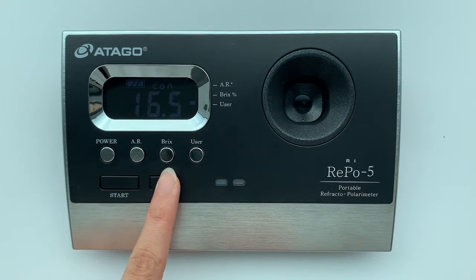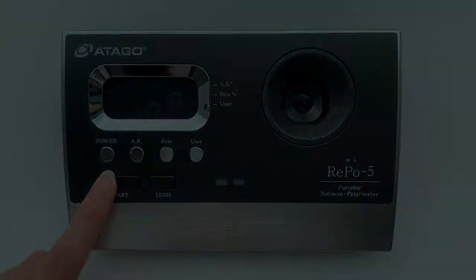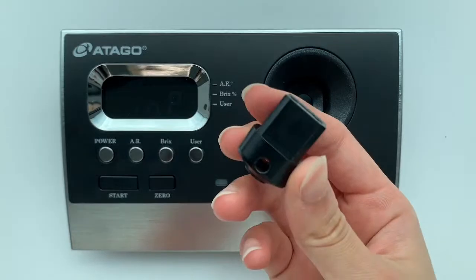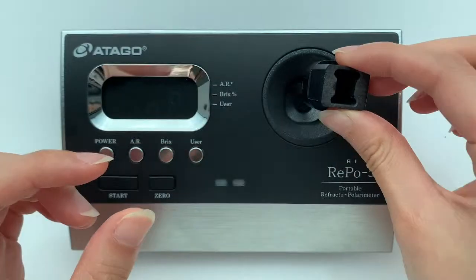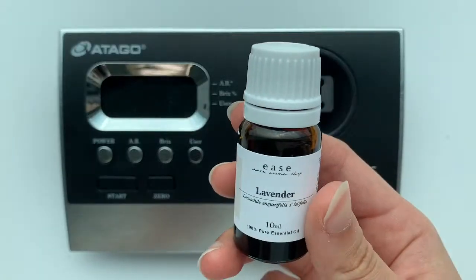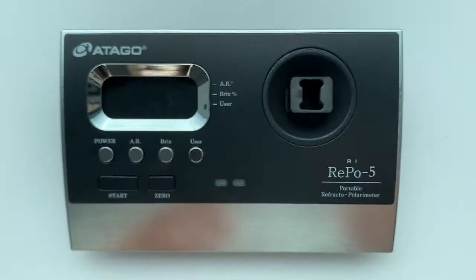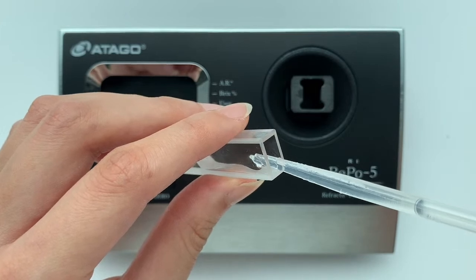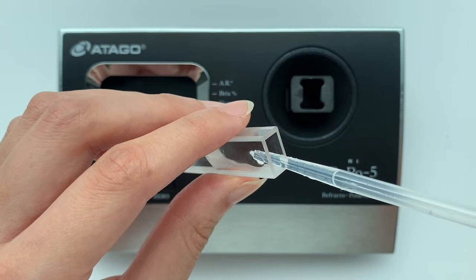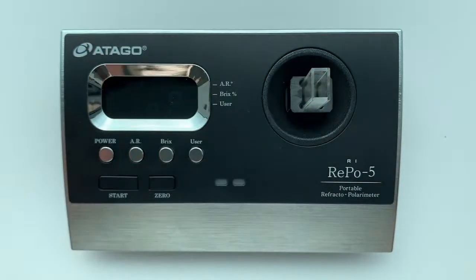We check the concentration setting — we've already calculated the concentration of this sample, which is 16.5 — and all settings are done. To prepare the sample: the adapter has holes on both sides and the sample stage has light sources on both sides, so make sure to match the holes together. For lavender oil, dilution is needed: 1 gram of lavender oil mixed with 5 grams of ethanol, filled into the glass cell.